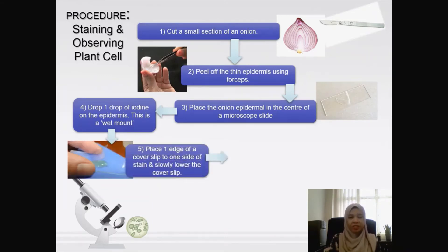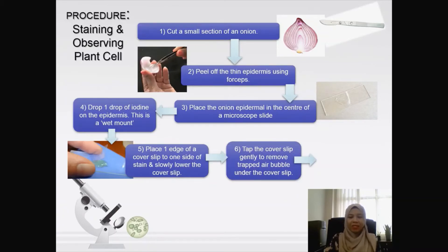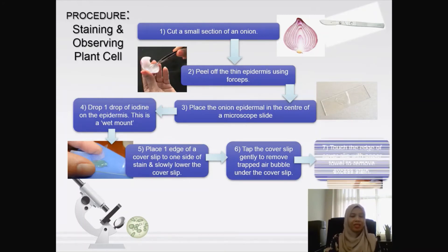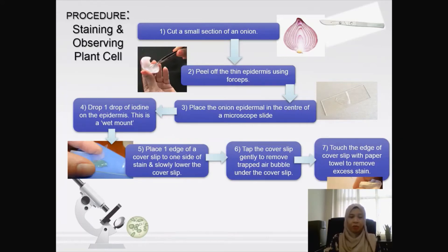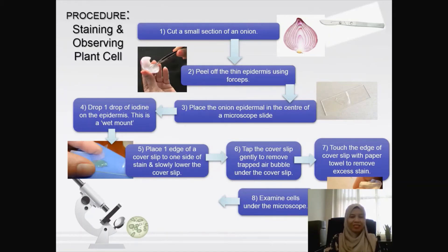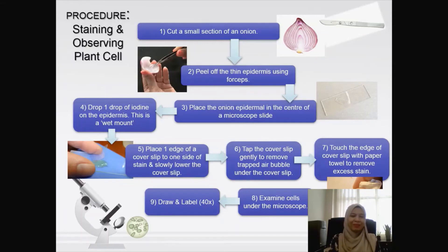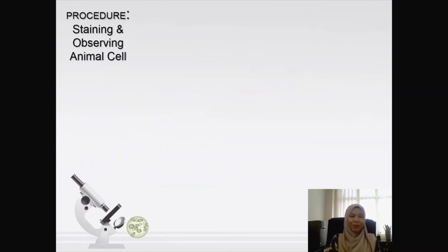Place one edge of a cover slip to one side of the stain and slowly lower the cover slip to cover the slide. Tap the cover slip gently to remove any trapped air bubbles. If there is excess stain, touch the edge of the cover slip with a paper towel to remove it. Then examine the slide under the microscope, observe, and draw and label the image seen.